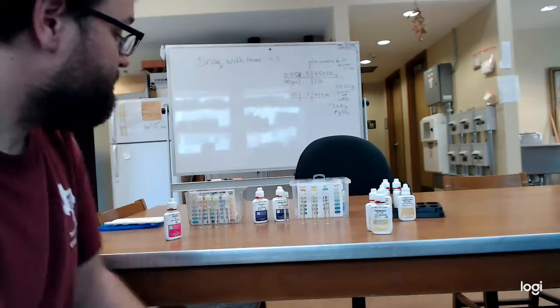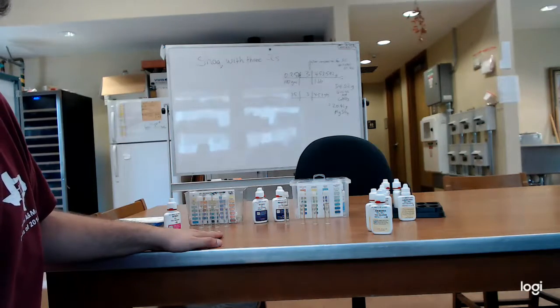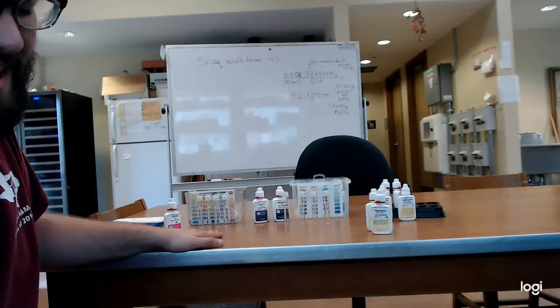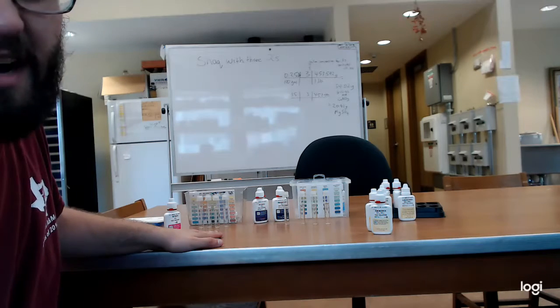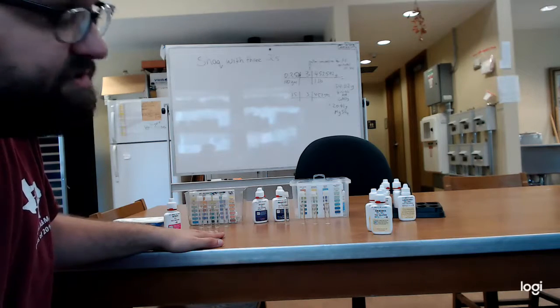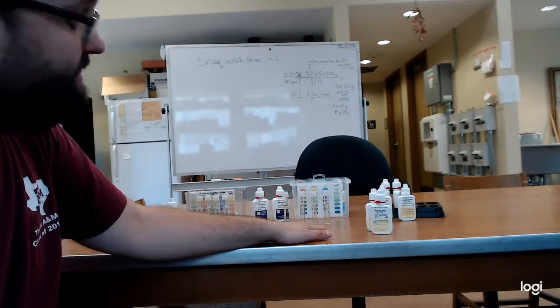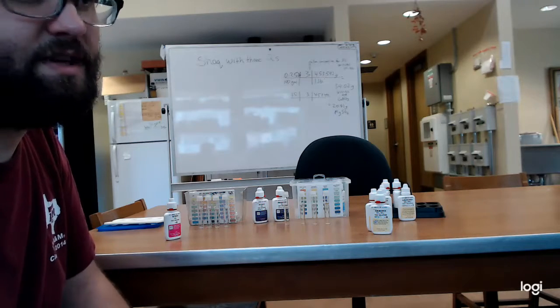However, right now I'm going to be doing a few titrations. So right now these guys on the left are going to be from a nutrient solution that's been aerated. I'll go more into why that's happening later. I know that's not really conventional, but that is just a control for the compost tea trials that I'm doing. And on this side is going to be a vermicompost tea that has been brewing. They've been brewing the same time under aeration, exact same amount of time.